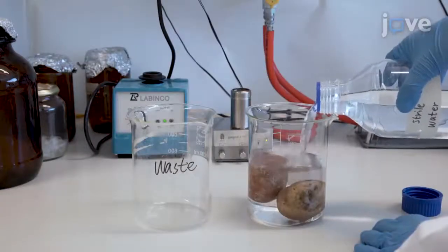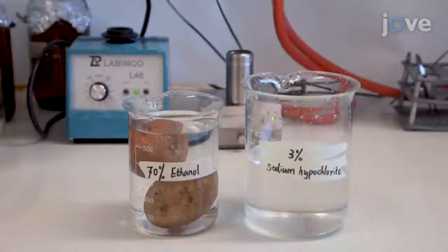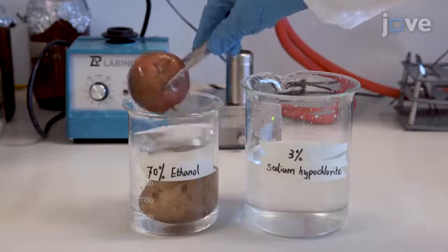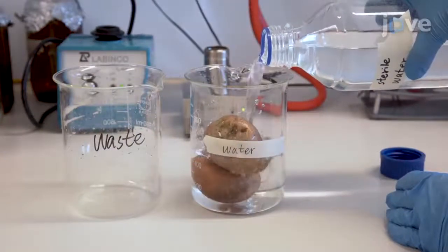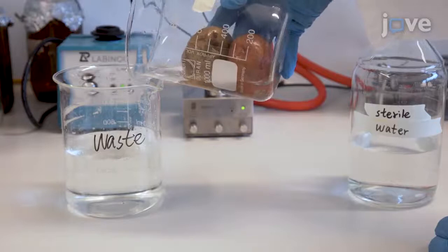To begin this procedure, rinse the potato surface with sterile water. Bathe the potato in 70% ethanol for 5 minutes and then in 3% sodium hypochlorite for another 5 minutes. Afterward, rinse it again with sterile water to remove any remaining sodium hypochlorite.